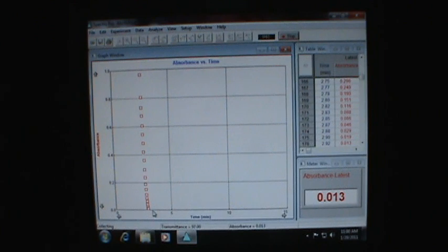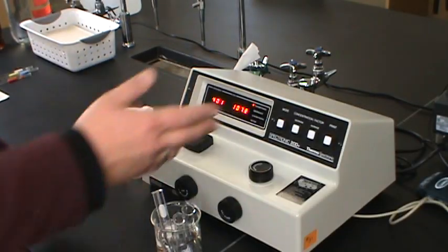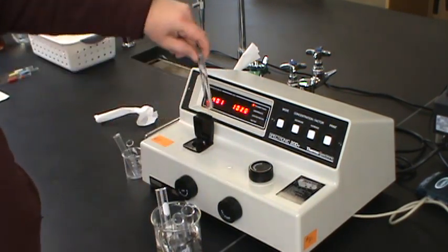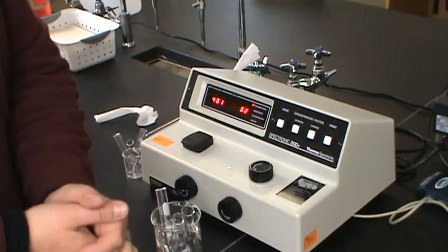My sample was starting to get pretty light colored so I popped it in the instrument and now you can see it's starting to collect data points. The absorbance is going down because the color is going away. And it's going down, down, down. A little slower. And all of a sudden somewhere in here it should level off. And if you look over here you see that it leveled off. It didn't level off at zero, but that's fine. All that really matters is that it leveled off. All the color is gone. So at this point we could go ahead and stop. We're finished with that run of the experiment.